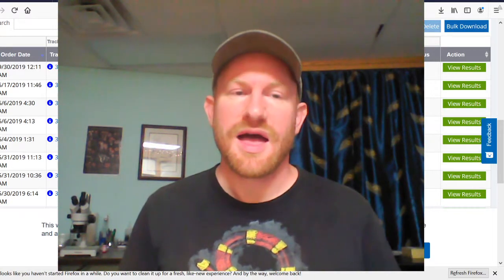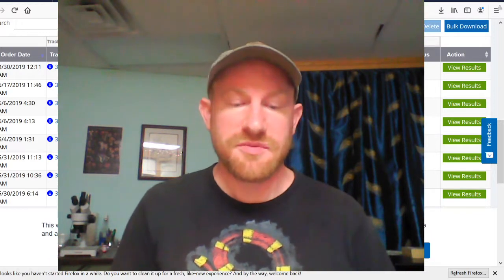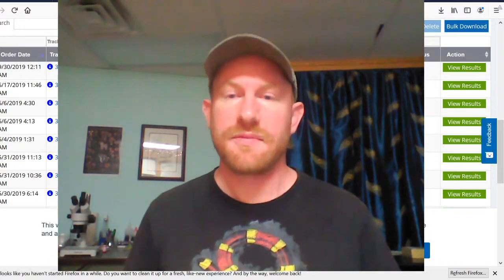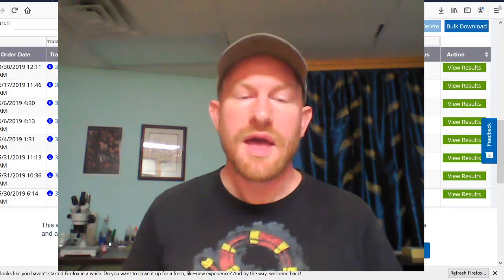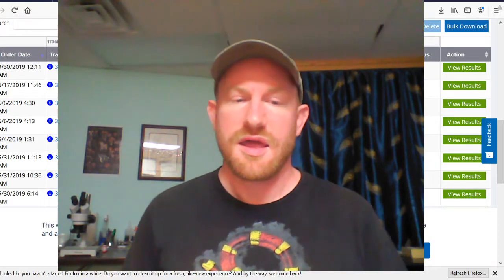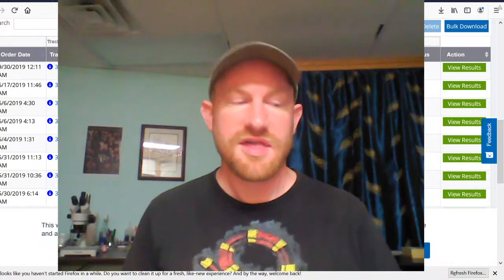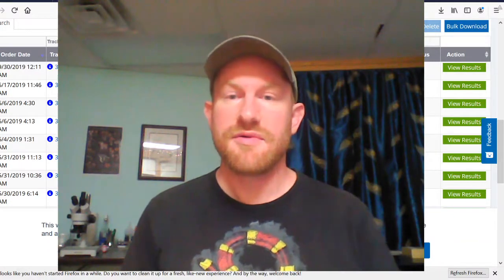Hello, I'm Alan Rockefeller, and I do a lot of sequencing of mushrooms that I find in California and Mexico. And today I'm going to show you how to edit these trace files and turn them into useful data. First we're going to download the traces from GeneWiz or whatever sequencing facility you use.